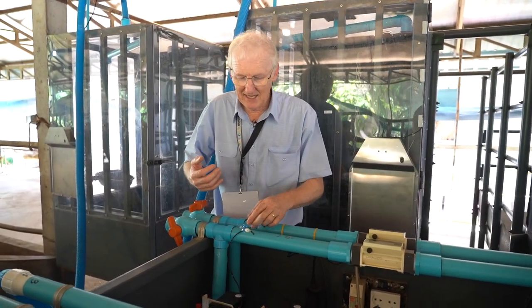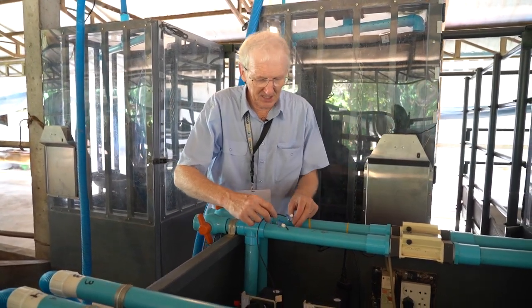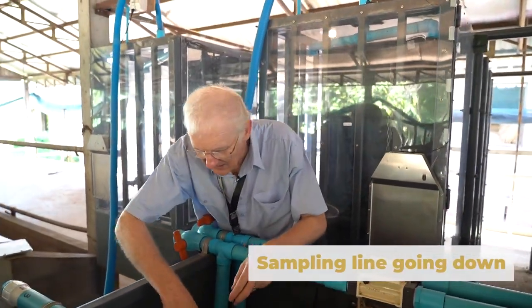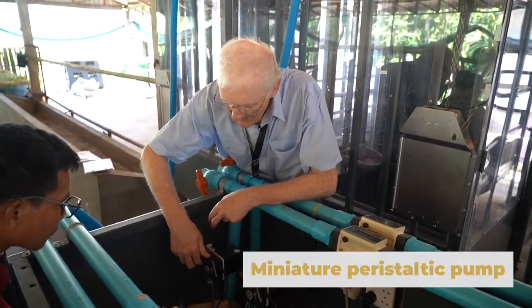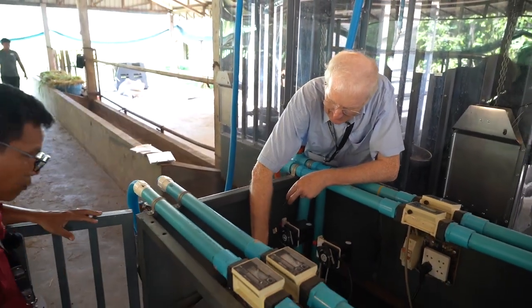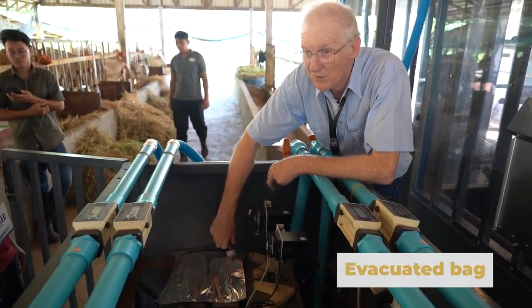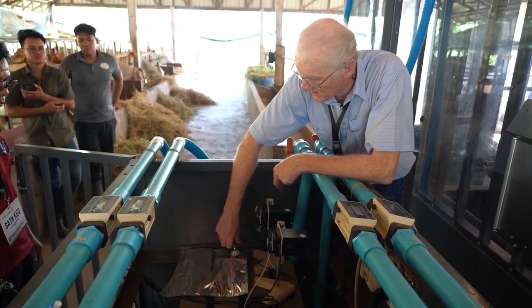We are ready to get our sample collecting. So here we are back on chamber 1. We have got this set so that there is a sampling line going down to this, which is a miniature peristaltic pump. The miniature peristaltic pump is connected, or should be connected, to a bag that is evacuated. So this bag should be clean. It should be flushed to make sure there is no residual gas in it from the previous use.